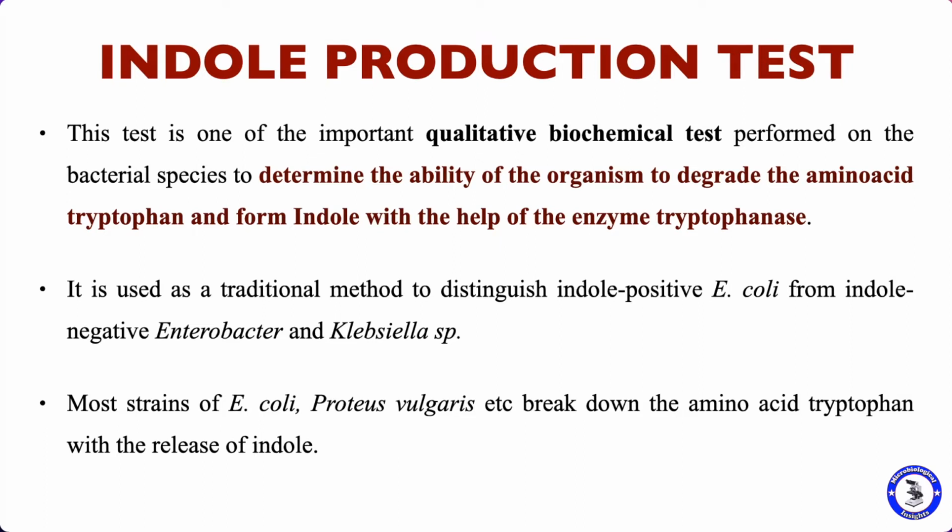This test determines the ability of a microorganism to degrade the amino acid tryptophan with the help of the enzyme tryptophanase. So, if the enzyme is secreted by the organism, the tryptophan amino acid is converted to indole, which is the end product of this test.